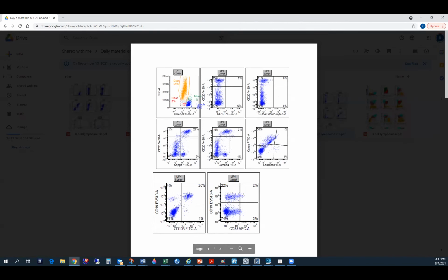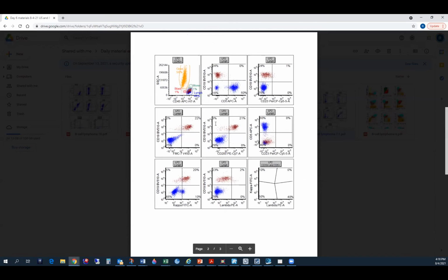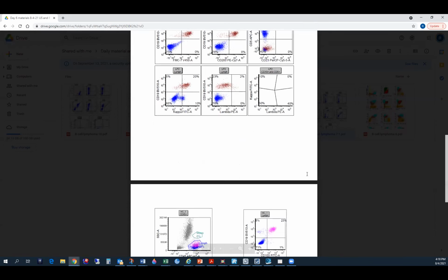The cells that are CD19 and CD103 positive are a little brighter for CD19 than the background polyclonal B cells. Even in this plot, you can subtly see two populations. That's basically why there is a trail. There are background normal polyclonal cells, and you see them here too, a small CD200 negative population, with something in the lambda. Same thing.